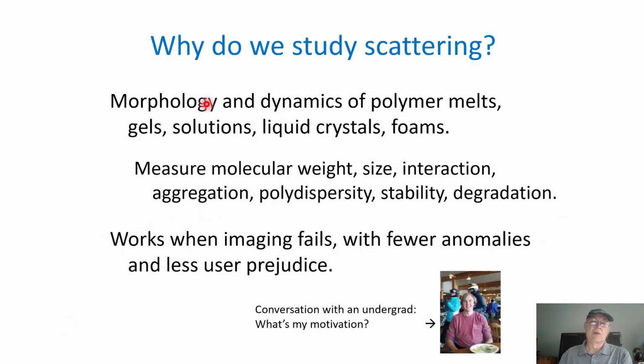So why we study scattering is for all the reasons that you see here. It applies in an incredibly large number of things. Interstellar dust scatters, clouds scatter. So there's all sorts of people. Our motivation is that we have an incredible number of things that we can understand. Also, light scattering works when imaging fails. It has fewer anomalies and less user prejudice than microscopy. It is still, though, not nearly as detailed a view.